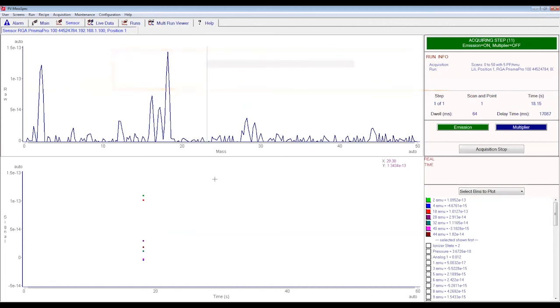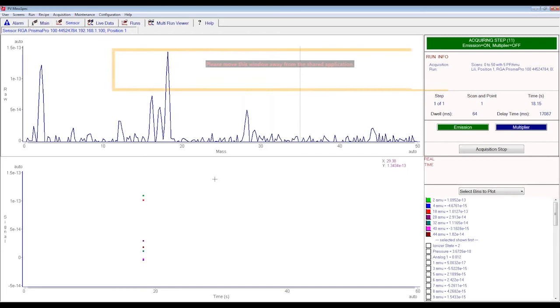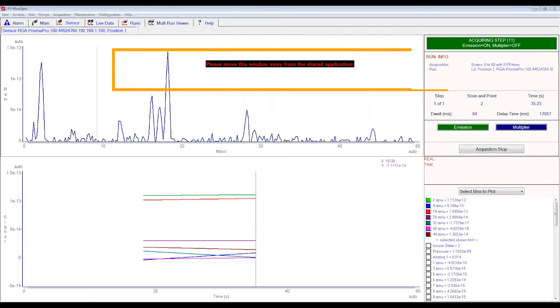The reaction takes place on the sample, and the nozzle collects the gas directly from the surface of the sample. Usually the concentration of products might be high enough to be detected sometimes. But of course it is quite a tricky thing, and it does not work for all samples.